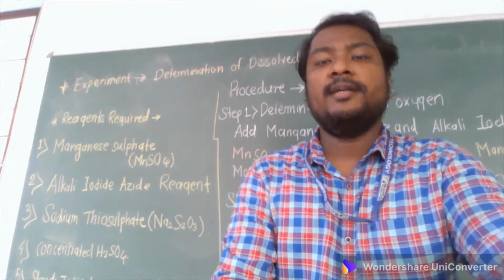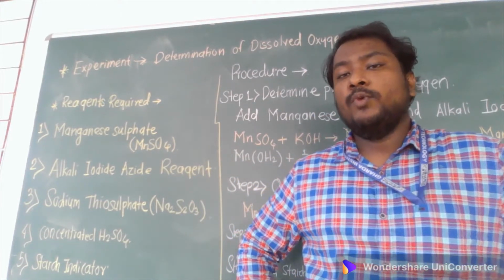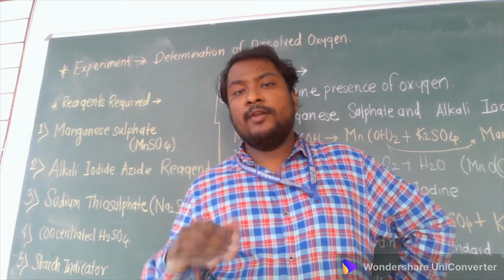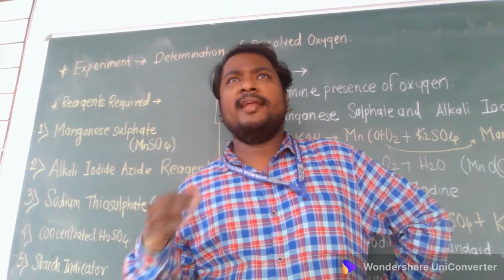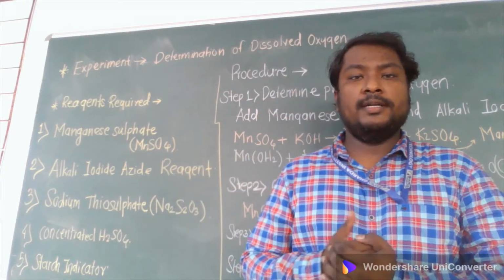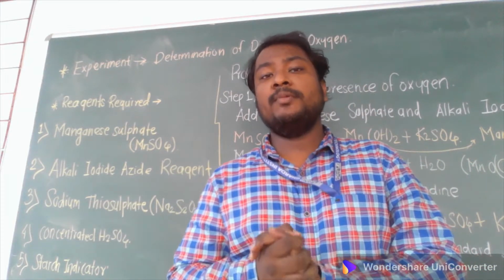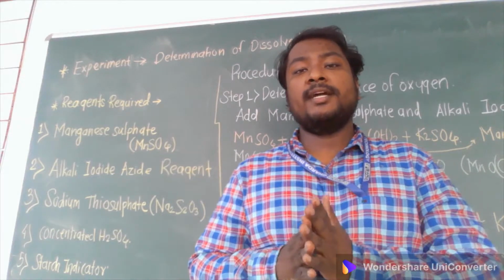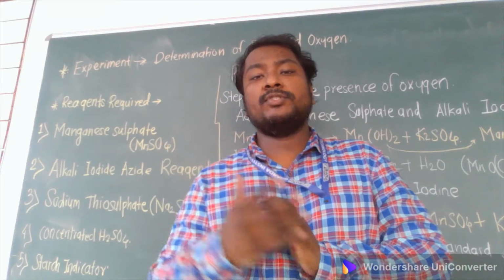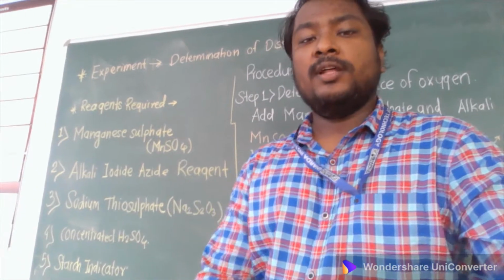Very important experiment. Each and every engineer, civil engineer particularly, who is working in the field of water supply and wastewater engineering cannot do any analysis without reference to this very important characteristic, that is nothing but dissolved oxygen. Theory I explained, definition I have explained. Now it's time to learn what the reagents required and the procedure are, before actually starting the demonstration of the experiment, dissolved oxygen. Let us see first what the reagents required are.